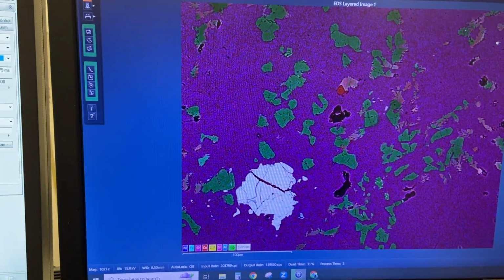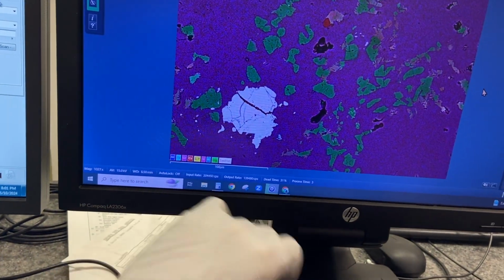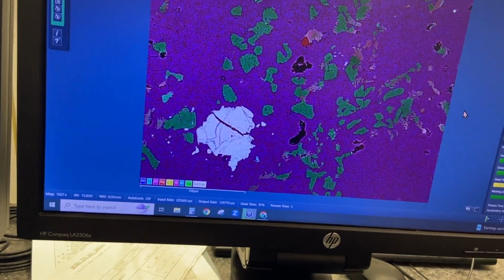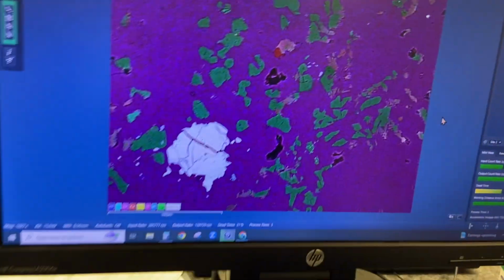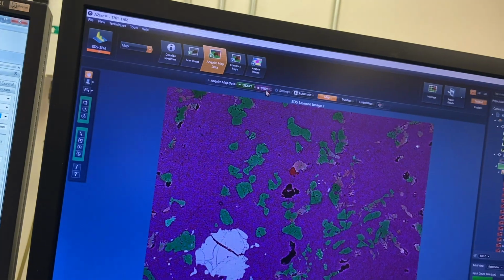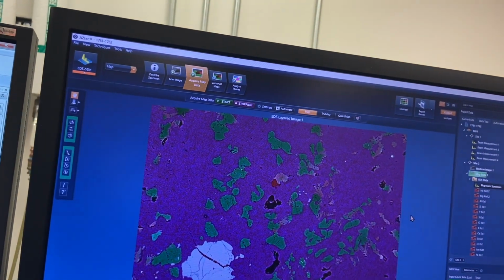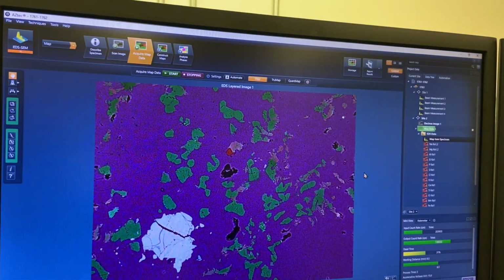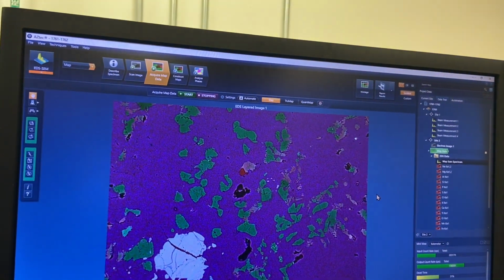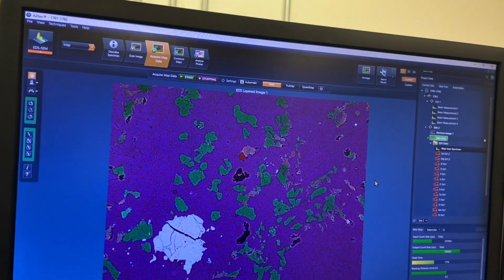So very interesting. You have some weathering products right there. I think that's a chromite, is it? Looks like it's got the color for a chromite. So yeah, very, very useful to get maps like this. I'm just going to hit stop really quick. I think it's going to run one more pass, and that's okay. I don't really need to run the full pass. It does 4 passes. I tend to run sometimes 1 or 2, but we'll just let that keep going.